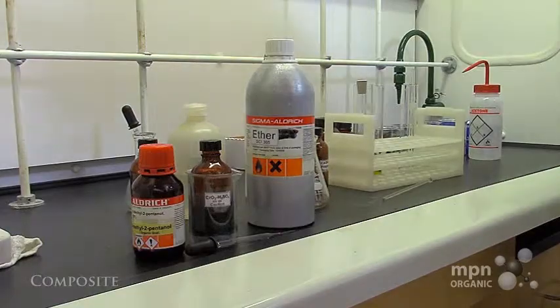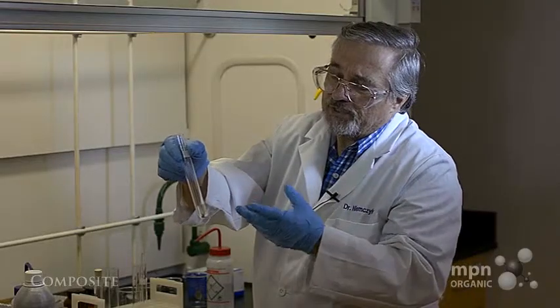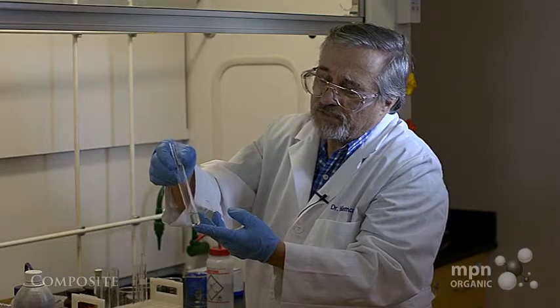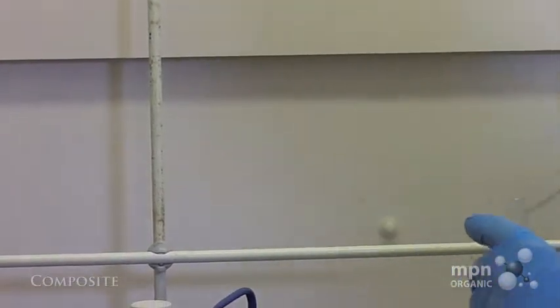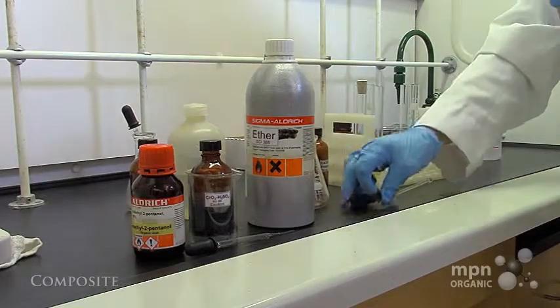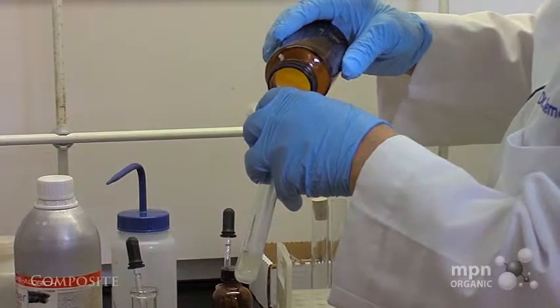Okay, so I decanted off a large amount of the diethyl ether. And now what I want to do is put some drying agent in there to get rid of the water that's in there. I have another stirring rod right here for that. Let's take some sodium sulfate. Now, sodium sulfate, remember, is a good drying agent. And let's put a little bit of sodium sulfate in there.